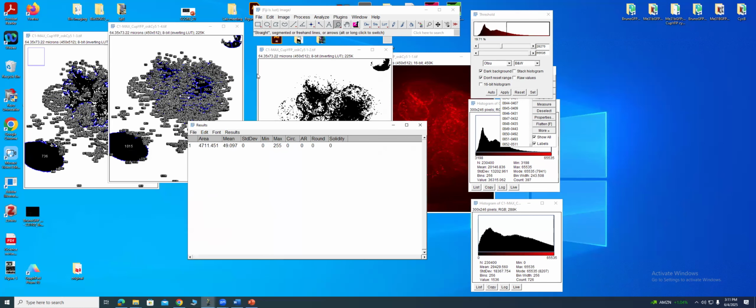So again, the key for us here is for you to understand that you have to make an image binary. The reason you do that is to do segmentation. You want to segment your images so you can say, above this, I'm considering it an object or a segment or a signal. Below this, I'm considering it garbage.